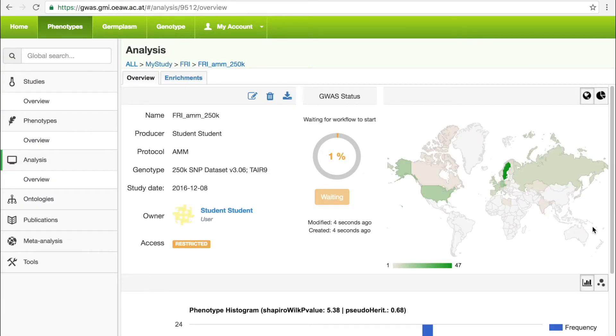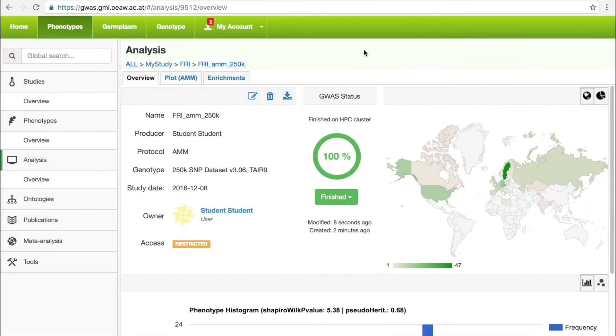The user is redirected to the detailed view of the study, where the progress of the analysis can be followed. Runtimes range between 5 minutes and 3 hours. Once the analysis is finished, the portal displays a notification on the user account tab.